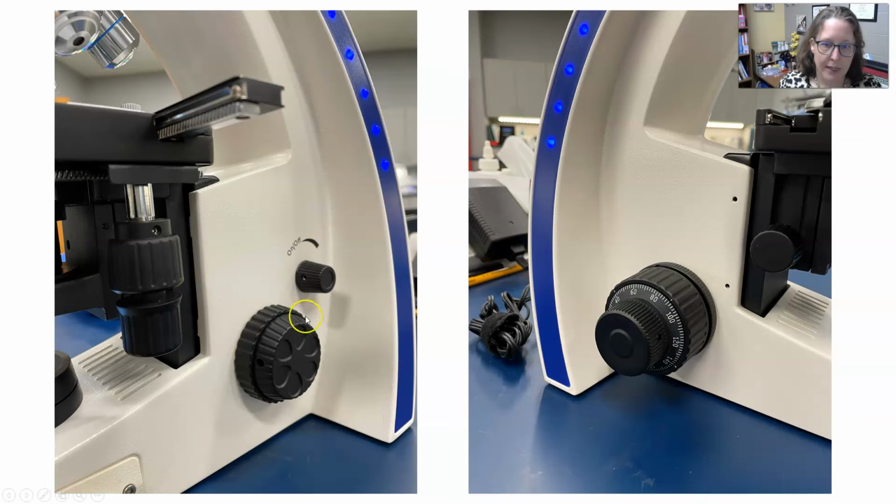So here are both sides of the microscope. You should have focus knobs on both sides of the microscope. The one closest to the body of the microscope, the bigger one of the two, is the coarse focus, so it moves that stage a lot. And then this one is the fine focus, and this one's the fine focus right there.